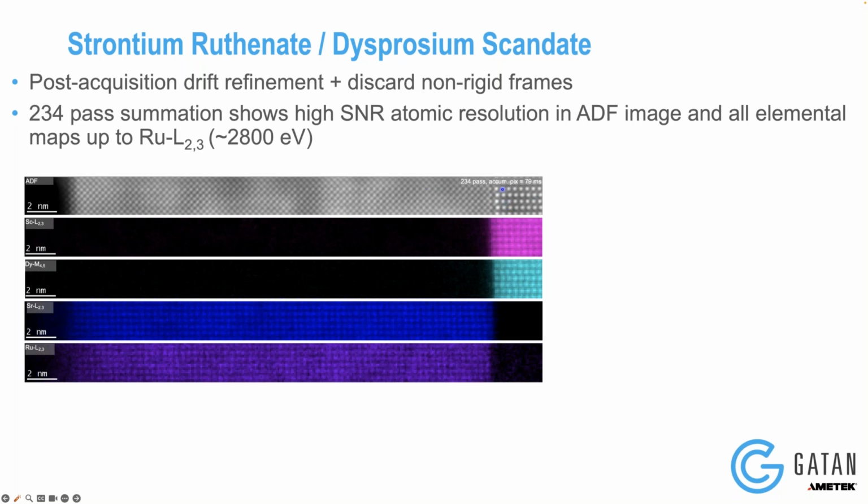Afterwards in the data, you might have one or two frames where it made a mistake depending on the filtering, but you can correct that with post-acquisition refinement, and you end up with really great data that would otherwise be very, very hard to acquire. So if you want to do these kinds of experiments, this is, in my opinion, a much easier way to do it than you might have experienced in the past. The go-to way.